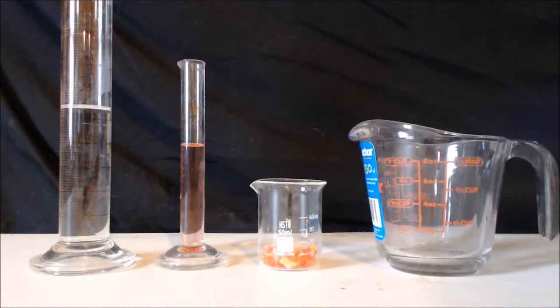All right, now from left to right, I have 53 milliliters of water, 8.5 milliliters of sulfuric acid, and 10 grams of dichromate, potassium dichromate. I'm going to mix them all together and make some chromic acid, and that will be my oxidizer.